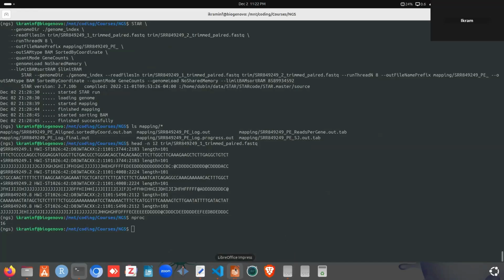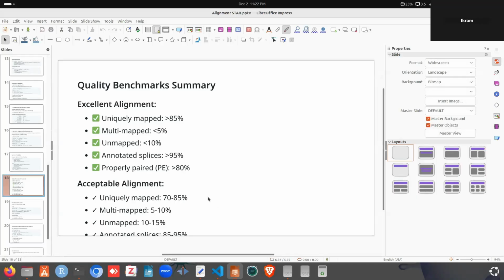So what we actually need to know is that the STAR tool indexes its genome using a suffix array. That is, it stores and organizes the reference genome into a suffix array, and then it starts mapping the reads from the FASTQ file, from the beginning to the end. In that process, we get some uniquely mapped reads, some multi-mapped locations, and some unmapped regions.